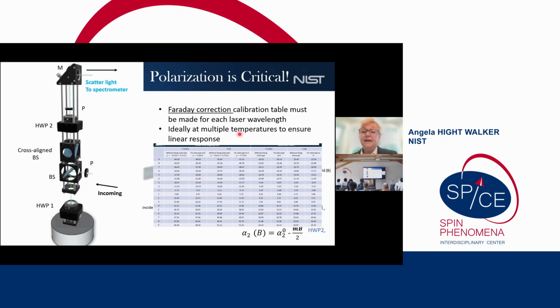And I bring this up because there is more than one paper in the literature where people have used a similar instrument without doing this Faraday rotation correction, and it can lead you to believe there are quite colossal polarization effects from things. So again, this Faraday correction in this case has to do with the objective and not the sample, and is really important.